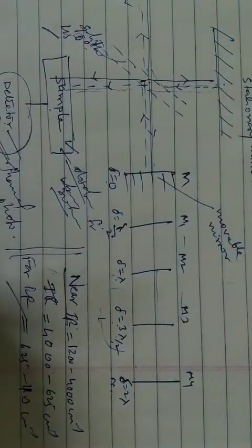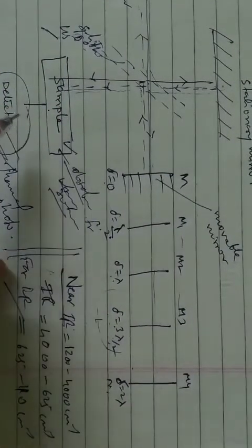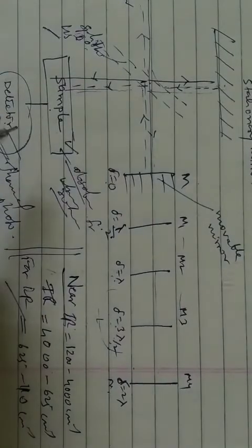A clear picture is obtained from this FTIR, but the same thing we lack in IR spectroscopy. So that is one advantage of FTIR. Maximum absorption, not a single bit left over, because of the design of these different mirrors. And you see here absorbed radiation and transmitted radiation passing through the sample, and the detector will detect the radiation.